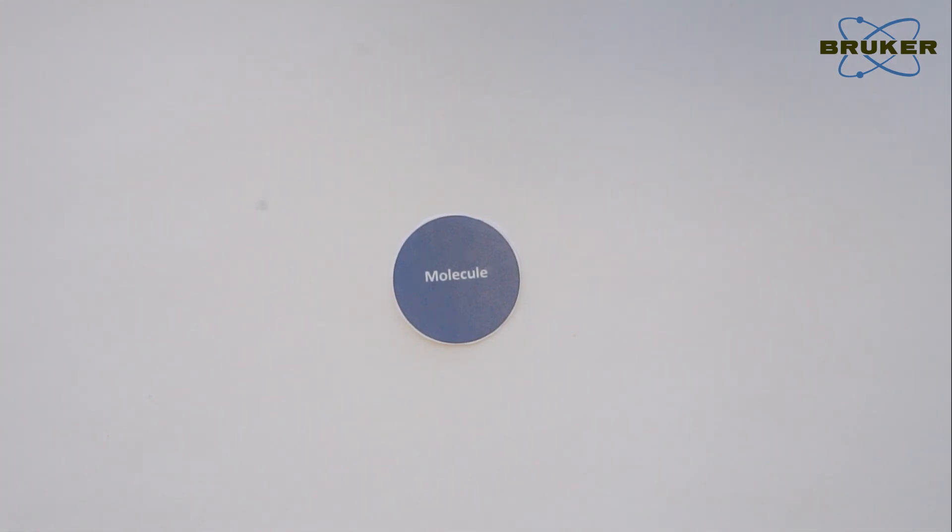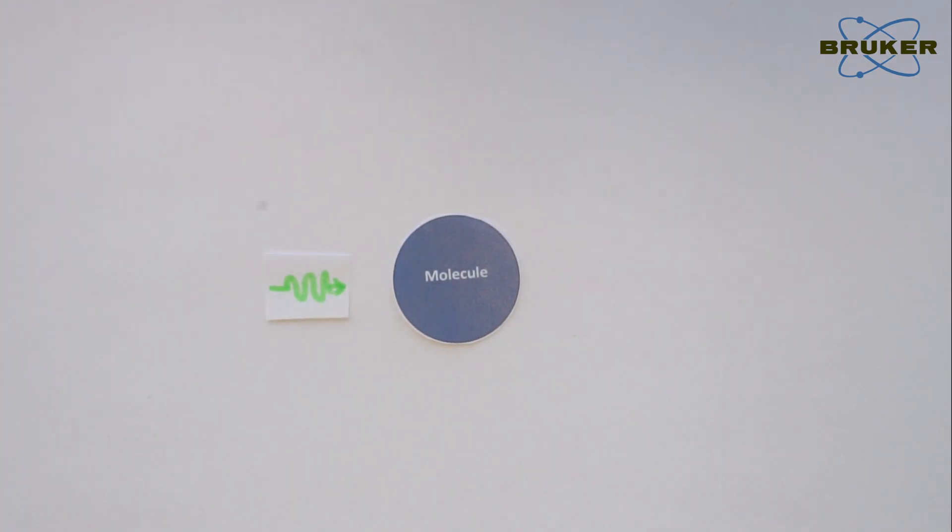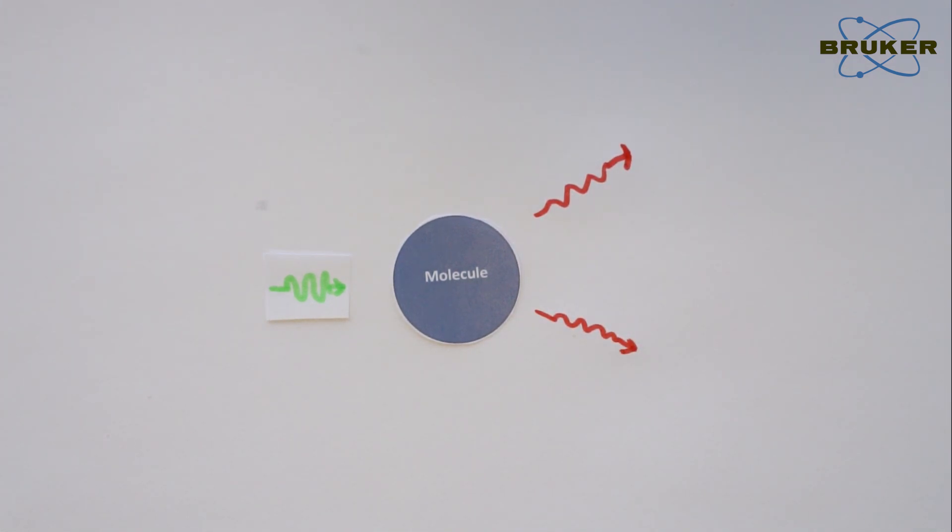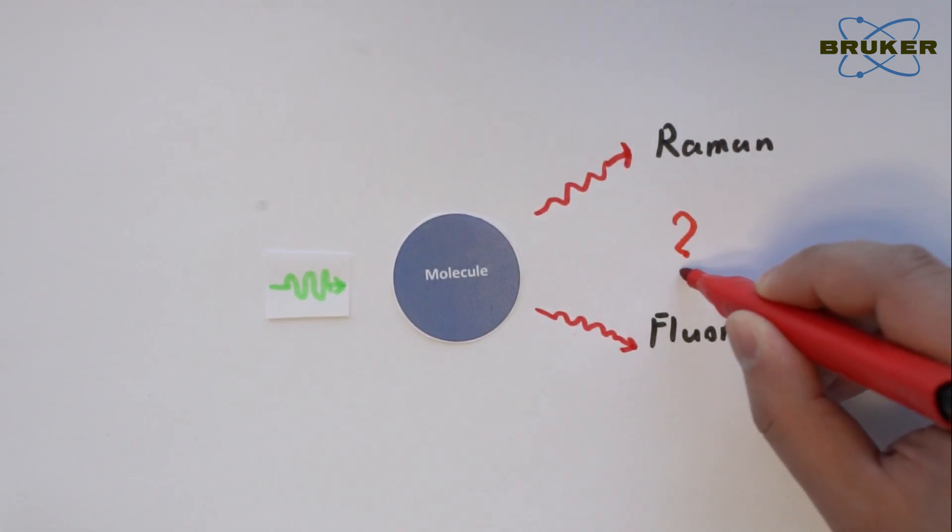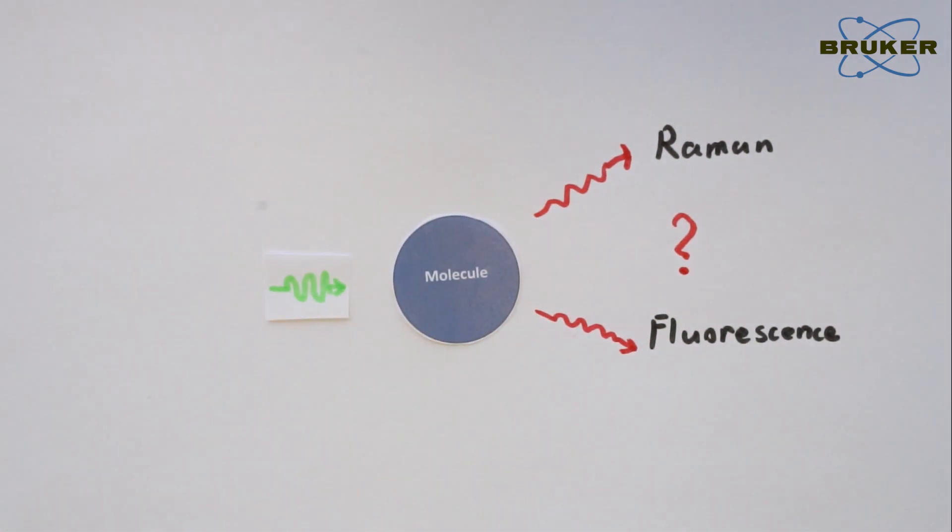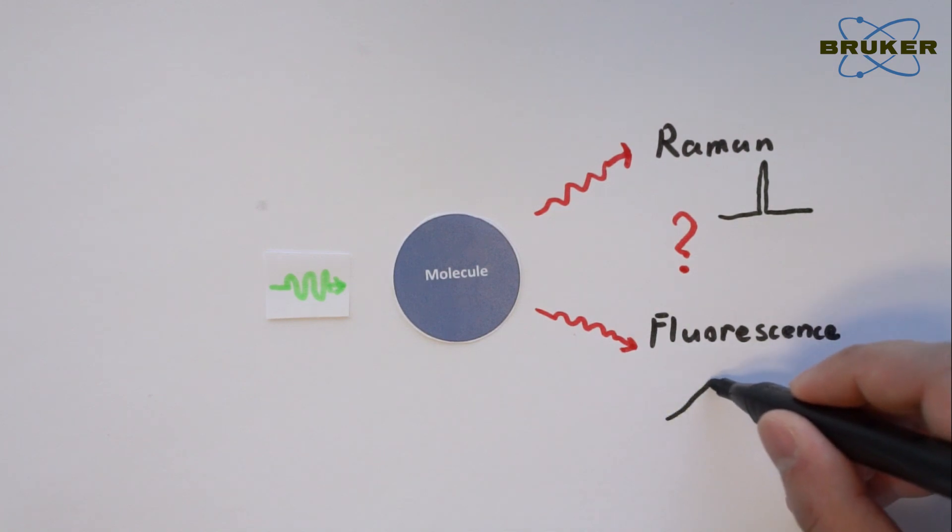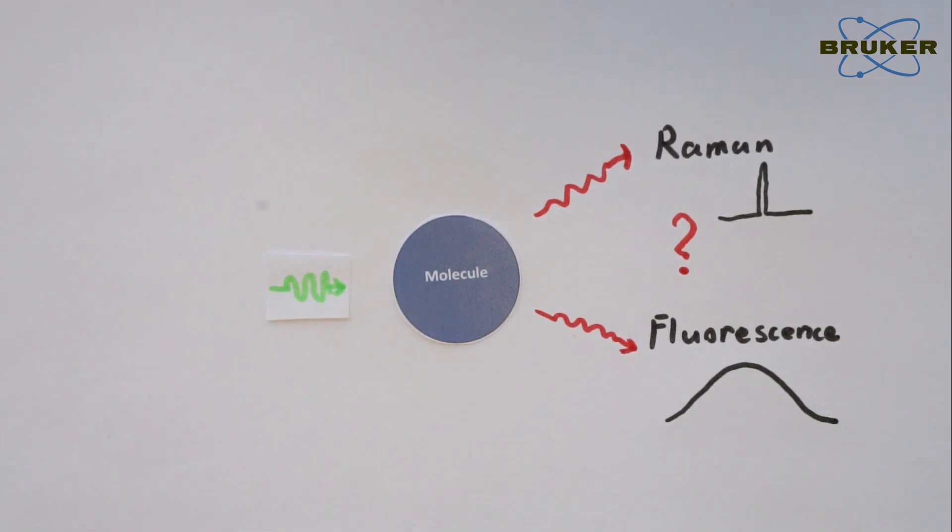The fluorescence effect is fundamentally different from Raman scattering process. Although both effects result in photons with longer wavelengths, and a detector will not discriminate between Raman scattered light and the light emitted by fluorescence. A fluorescence spectrum appears much broader than Raman and does not hold information of molecular vibration.